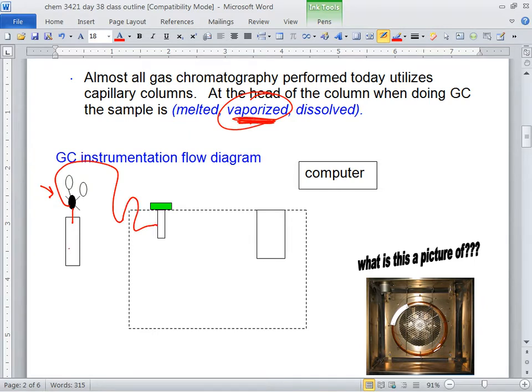So here's your mobile phase. In fact, we use hydrogen gas. You can label it mobile phase or hydrogen gas, but here's our mobile phase. There has to be a big container of it somewhere under really high pressure, and again it has two gauges, one for what's going out and the other for what's in the tank. It's kind of confusing, so I'm just going to leave it out. You have to know what dials to turn and where. That's more for a course on instrumental analysis.